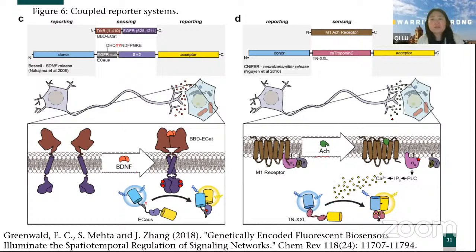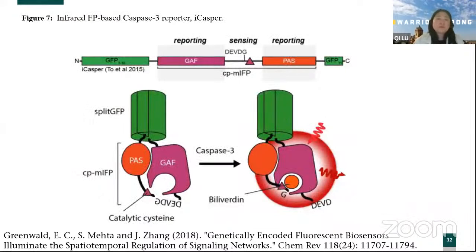It will cause the target cells' fluorescence to change, and so I think that's pretty cool. And also, this is a Caspase 3. After shining with the light, and if there's also the chromophore added, it will cause a fluorescent emission.